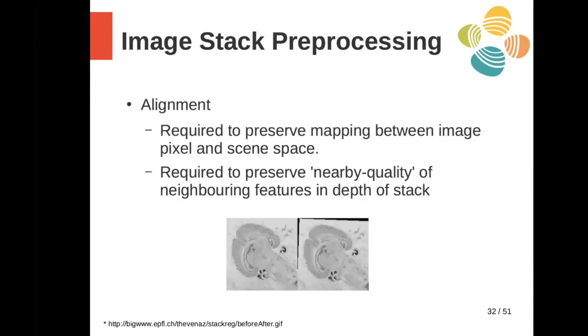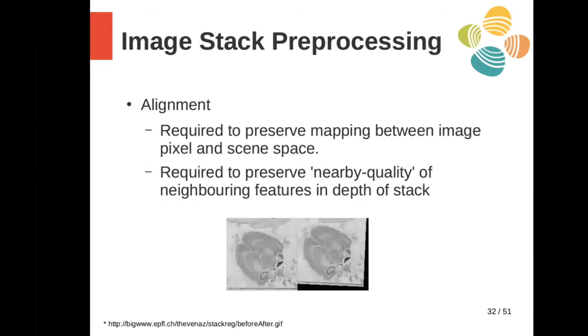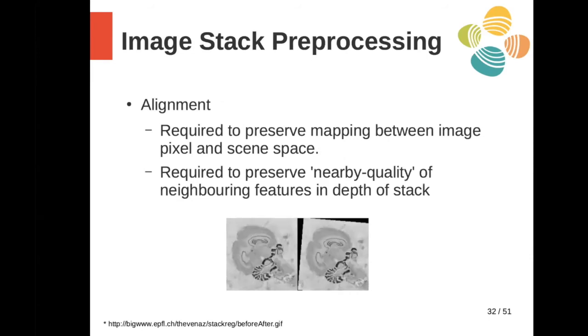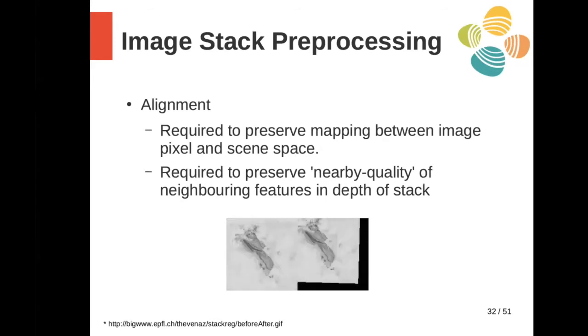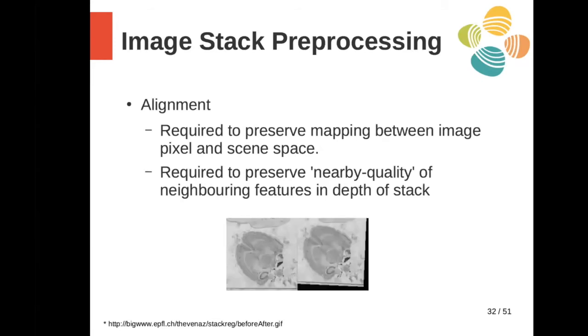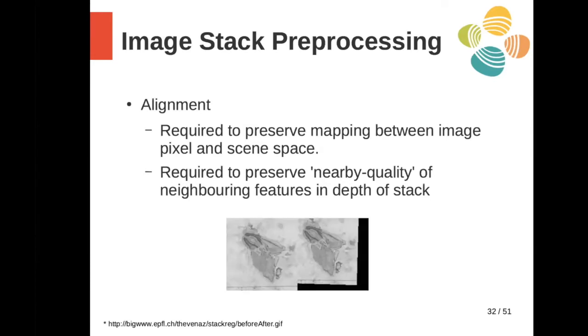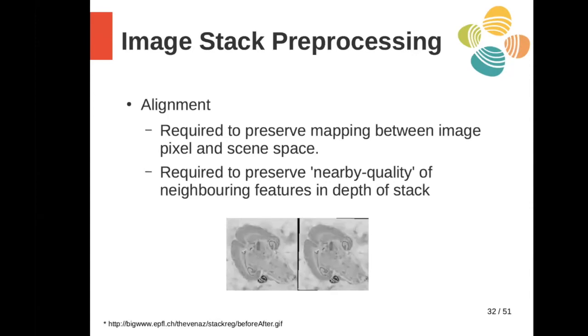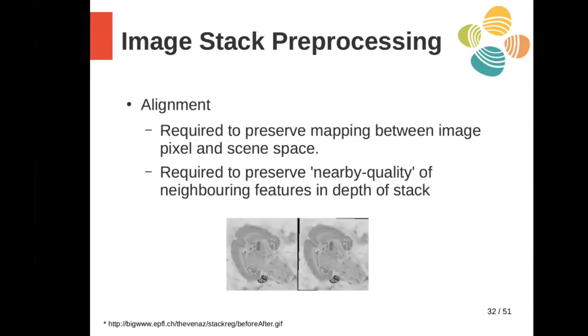So what we've seen so far are the qualities that an image stack should have, and the characteristics of the image stacks that the different kinds of microscope technologies produce. We have seen a little bit about the technical attributes of the image stack, its bit depth, number of channels, and things like that. Now we want to talk about processing that image stack for best results.